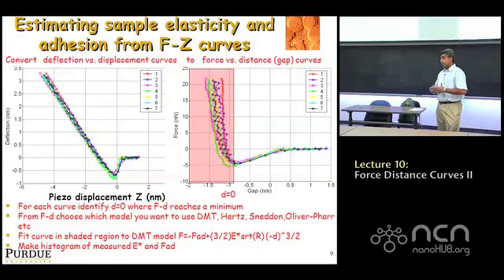But when you start doing very large indentations in very soft materials, you can't approximate it as a sphere anymore, and you have to go to Oliver-Pharr kind of analysis that allow you to put in force indentation curves for conical indenters, for cylindrical indenters, conical with spherical tips. There are a lot of modifications of those things also available. Okay, but for most polymers like this, this is reasonable. Maybe for really soft polymers, you might go to JKR kind of models, okay?